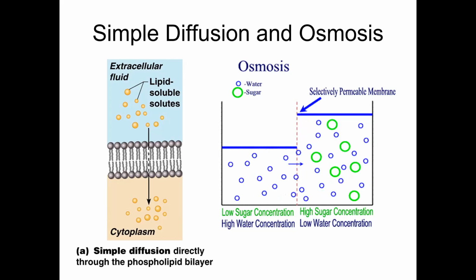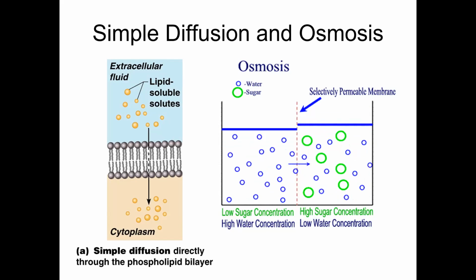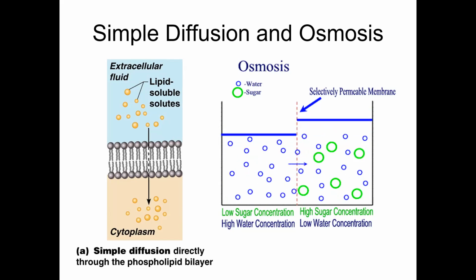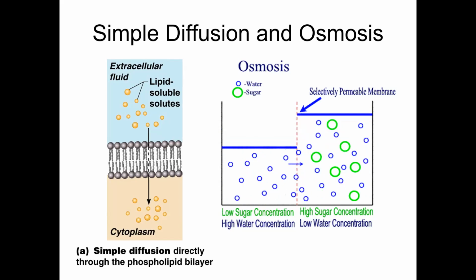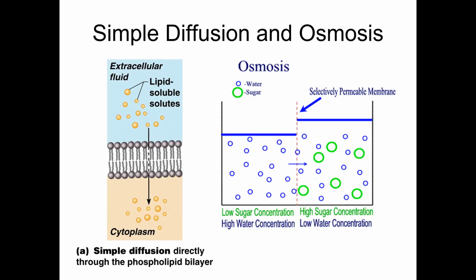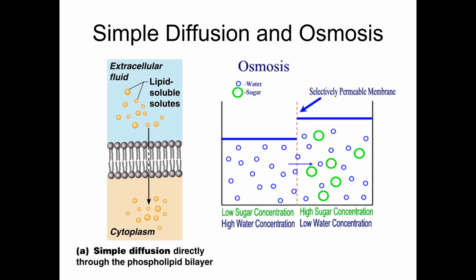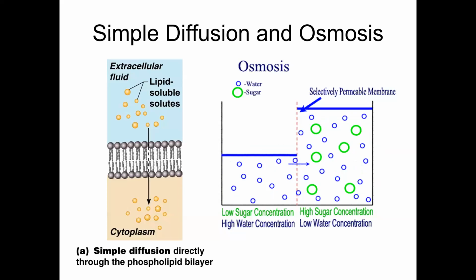And if I put the cell in the right beaker, which is always a possibility, we'll let it run for a while. And what will happen, and it worked very nicely yesterday, is that the cell containing the salt water gained water and gained weight. The cell that contained distilled water and was placed in the salt water lost weight because water moved across the membrane. It usually works. Sometimes it doesn't, but it usually does.